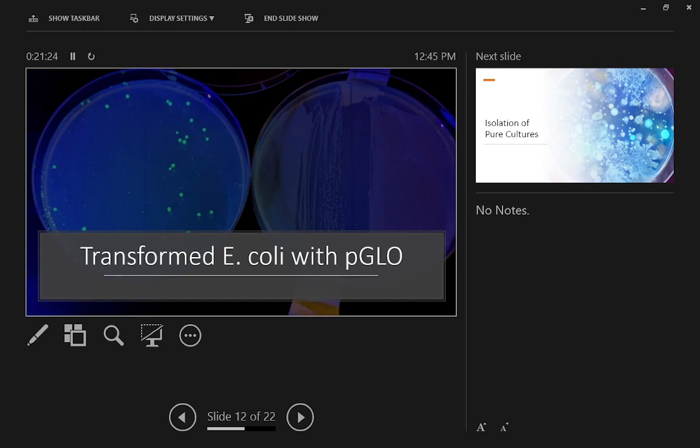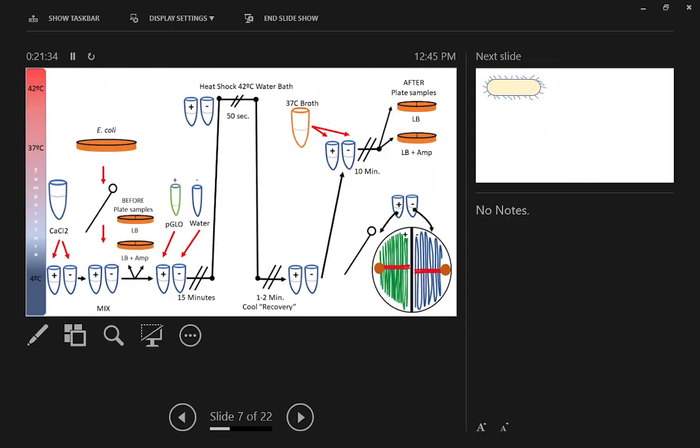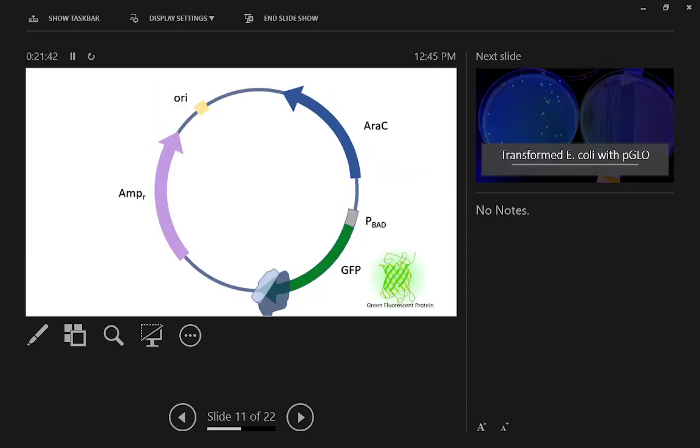What we will do on day one is we will do the isolation, which we'll talk about in a second. On day two, we'll do the transformation, but on day one, we'll also have a little puzzle to do with this image. So you guys get an idea of how this is supposed to go, so you get that locked in your brains really well, and then we'll do the rest. I shouldn't have made so many clicks for that.